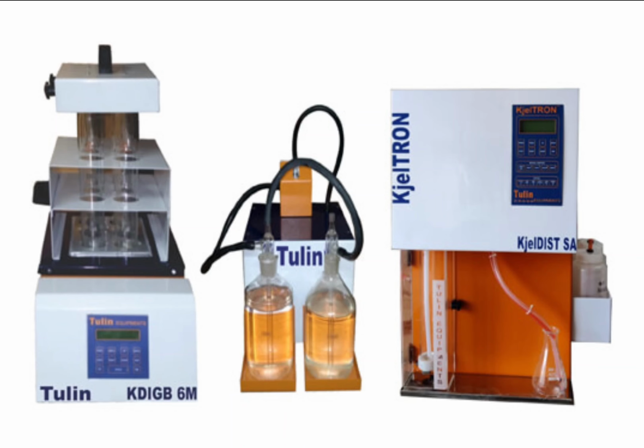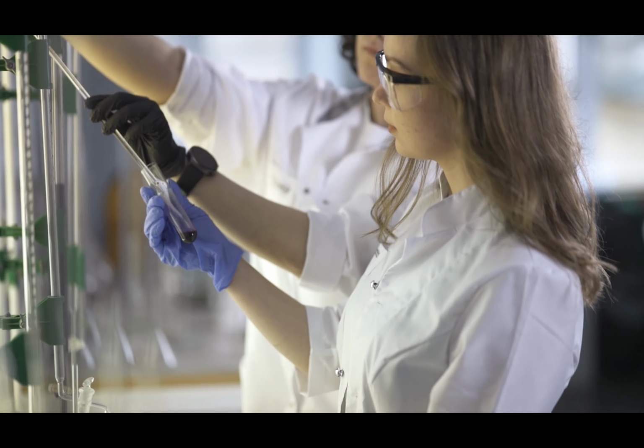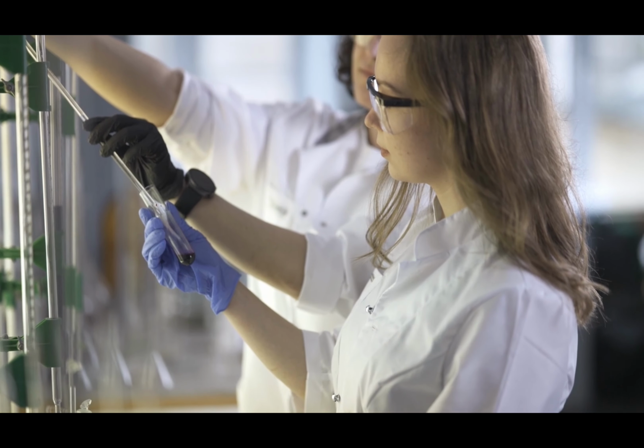So in conclusion, the automatic Kjeldahl machine remains one of the most important and trusted laboratory instruments for nitrogen and protein analysis. Whether you work in agriculture, food quality control, dairy products, veterinary or biomedical research, this instrument is essential.